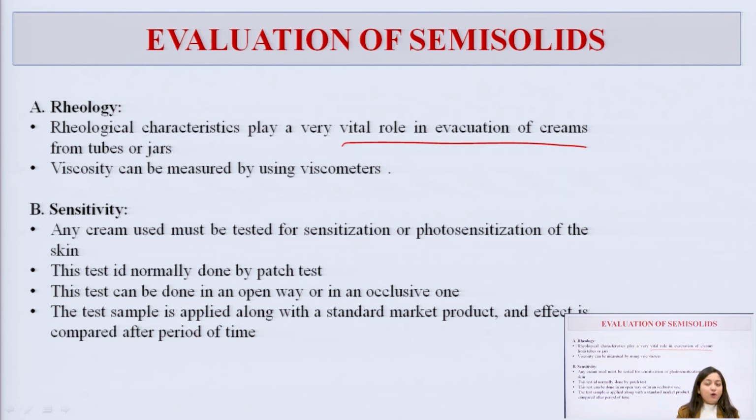If the rheological testing is not done properly, then the evacuation is always a serious problem, and the desirable quantity of cream won't come out from the collapsible tube. So, it is important to understand how much quantity is coming out at a particular pressure.